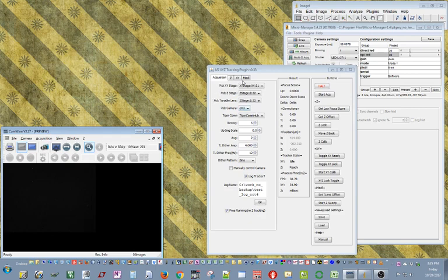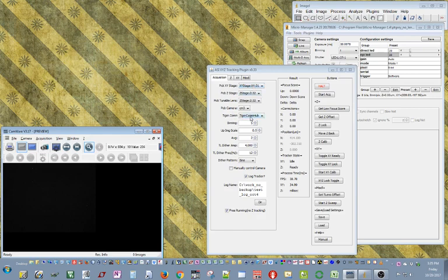I have a PCO Pixelfly camera on a second imaging path, and it's running outside of Micromanager, so that could be your main data acquisition camera.